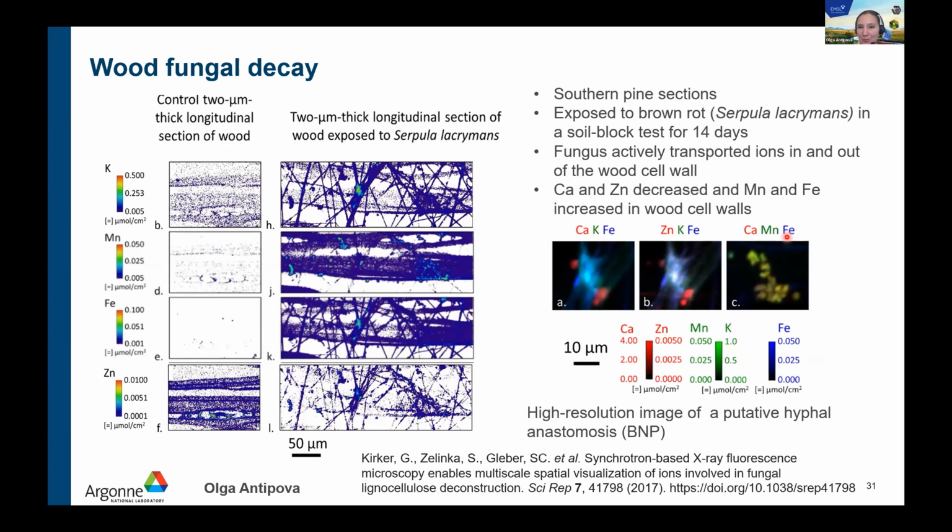This kind of refers a little bit to Jocelyn's talk here. We were also visualizing fungal decay in pine wood. In this case, wood samples were incubated for 2 weeks. They were exposed to brown rot, and then changes in the distribution and in general content of certain elements were visualized using X-ray fluorescence microscopy.